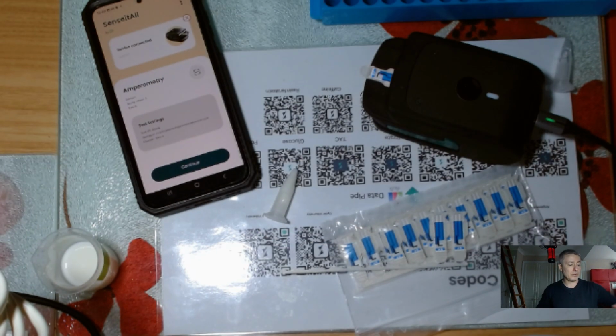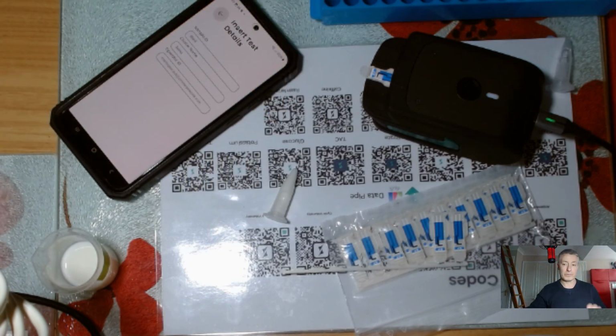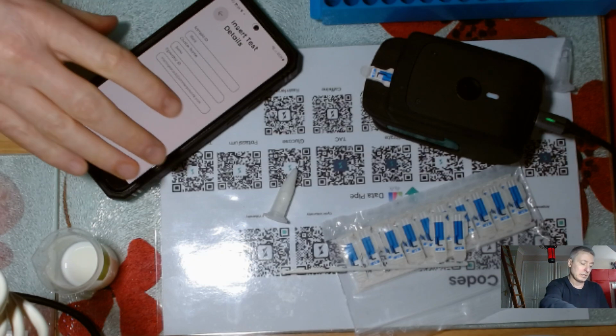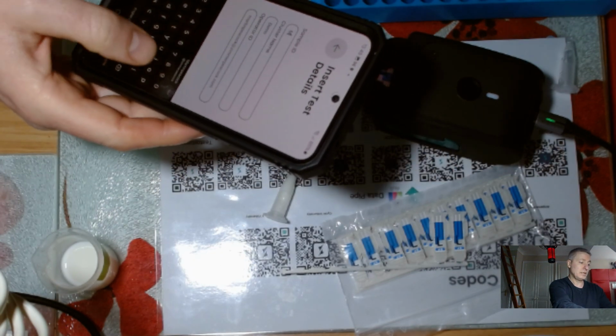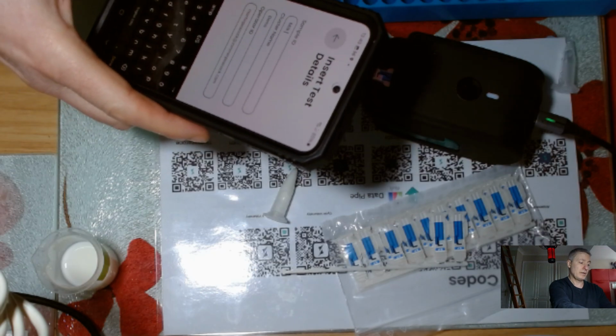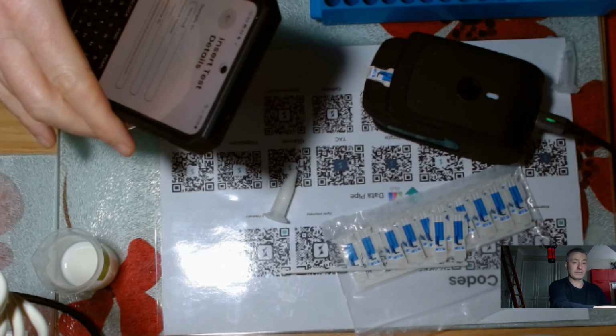Now I'm going to go to the experiment itself. I'm thinking aloud a little bit. I'm going to take milk that has not had PAA added to it. I'm using the SenseItAll platform. I know I didn't do a big introduction on that, and I suppose as I do this I should say the SenseItAll platform is a way of going from an idea to a tangible piece of hardware.